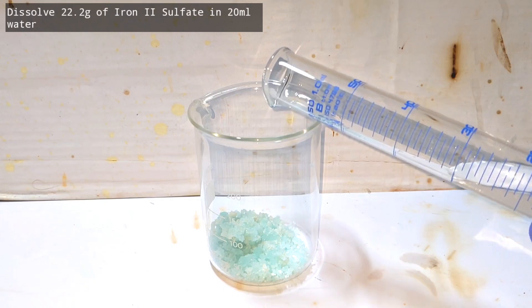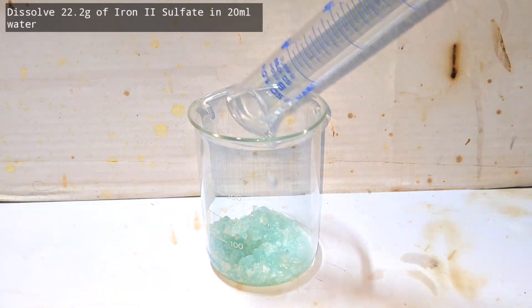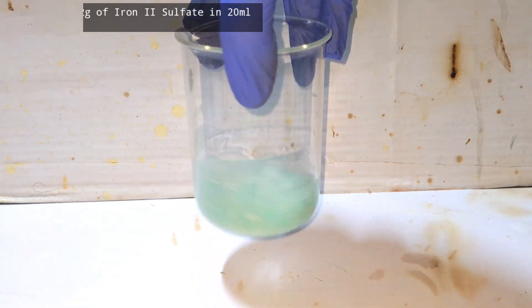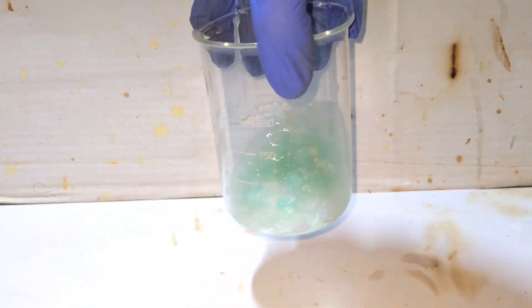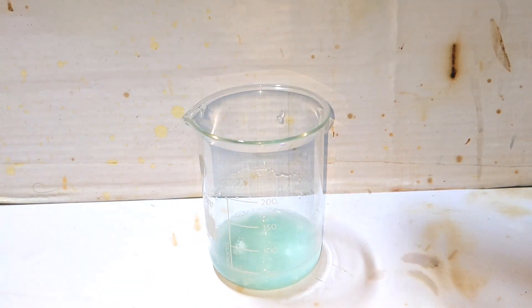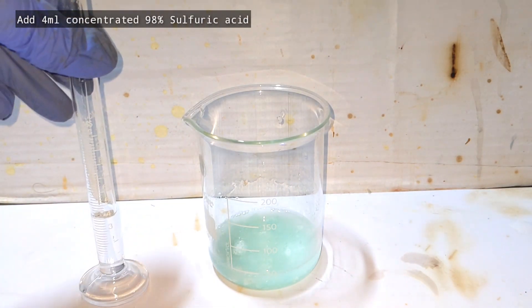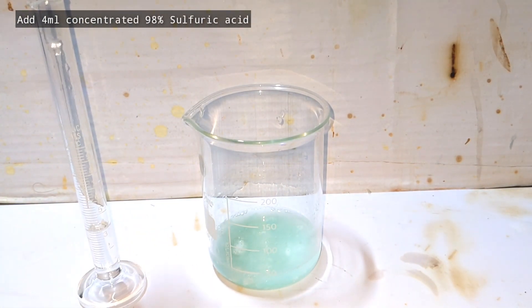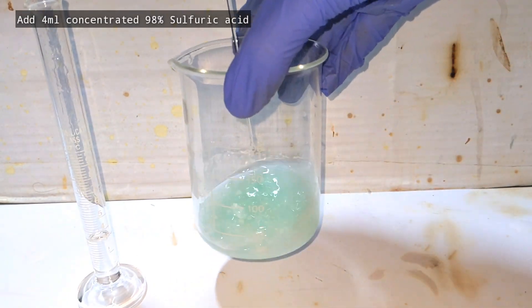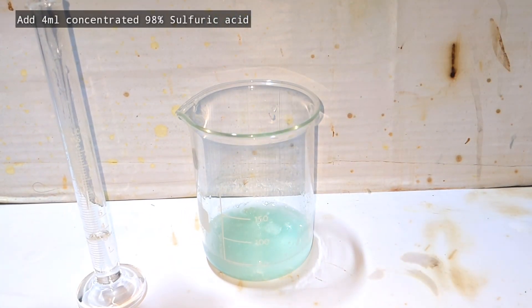Start by dissolving the iron(II) sulfate — ferrous sulfate — in 20 milliliters of distilled water. My ferrous sulfate was freshly made one day back, which is why it appears a nice green color. Older samples often become yellowish-brown due to air oxidation.